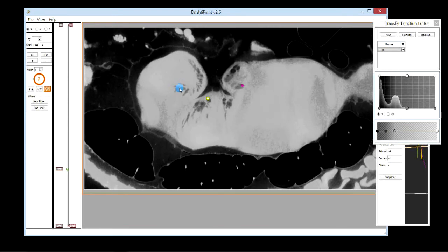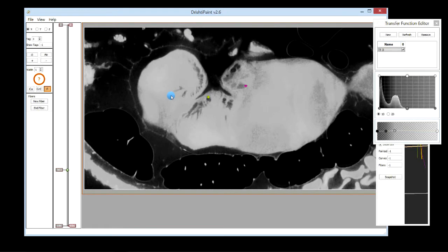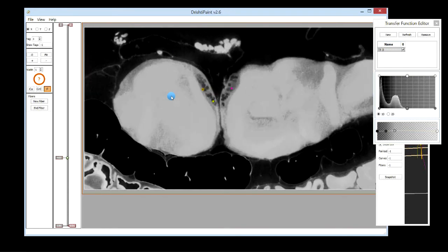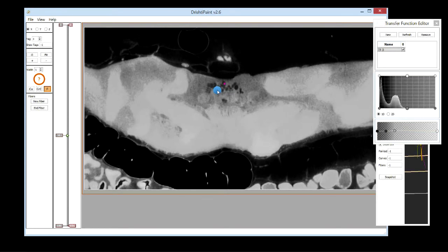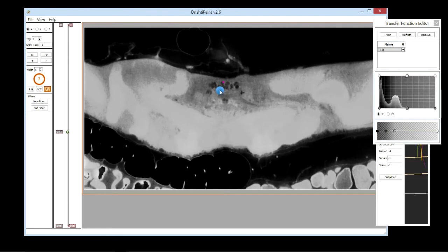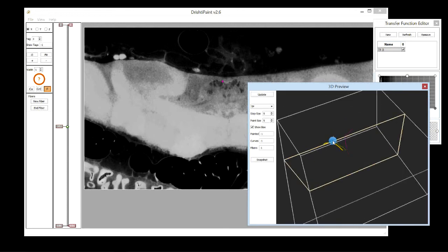And then you can actually delete that with the right mouse button and add a new point. So if you are off track, for example, then you can easily delete a point and then add a point. So there we go, and possibly goes there. And then I've really lost track. So this is the new fiber.